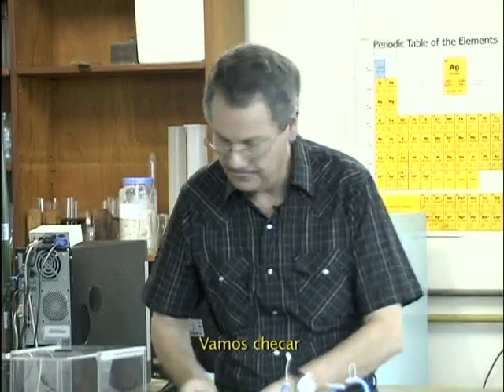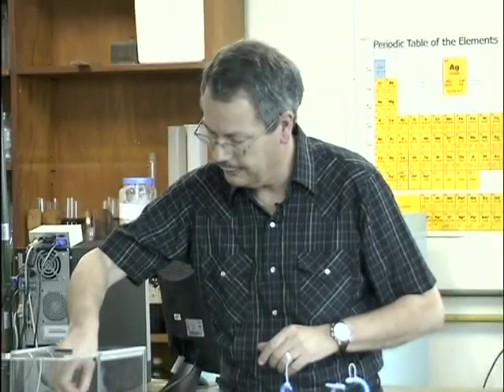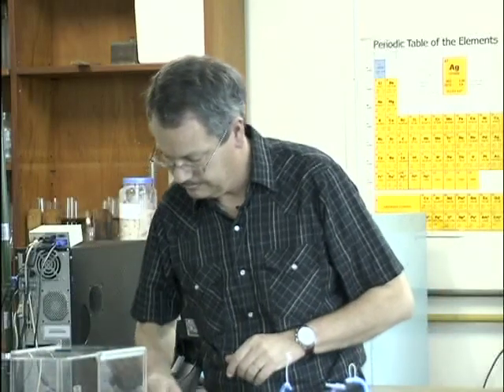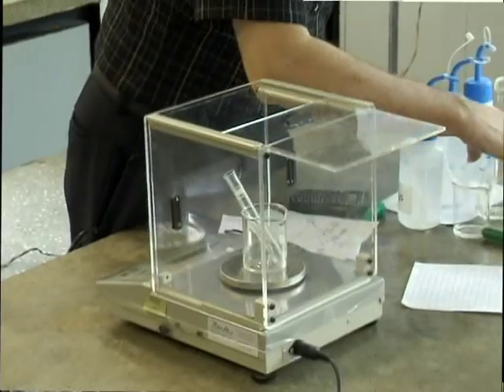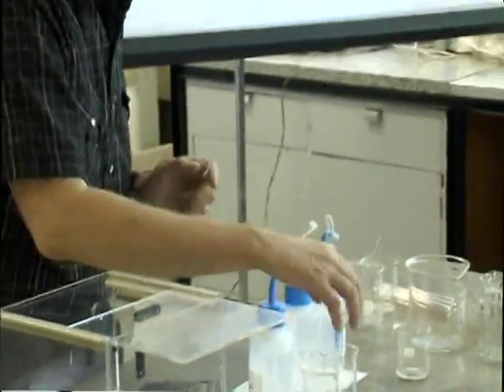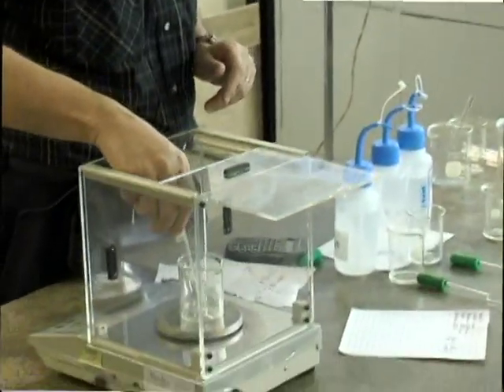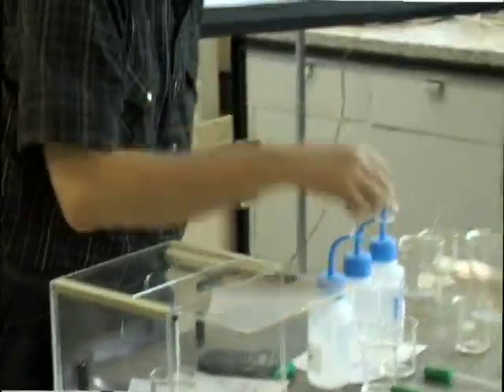So let's check. Third tube, this one. Zero again. So we say 80% THF. I can use that one. Is this zero? Yes.